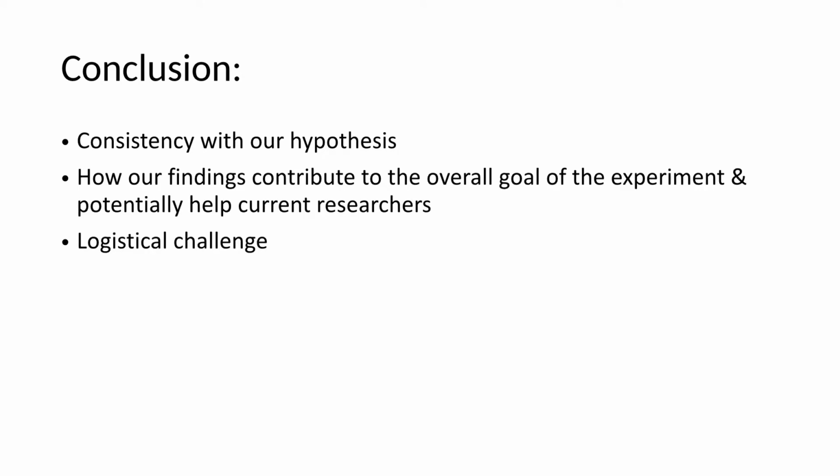As for our conclusion, according to our gel in Figure 3, the expression of TOR1 decreases when in starvation phases and decreases when in log phases. According to what we originally hypothesized, the expression of TOR1 in starvation phases decreasing is consistent, while the expression of TOR1 in log phases decreasing is not.